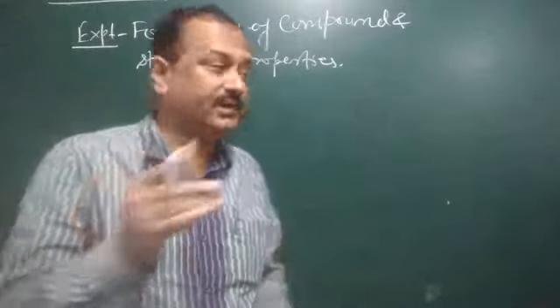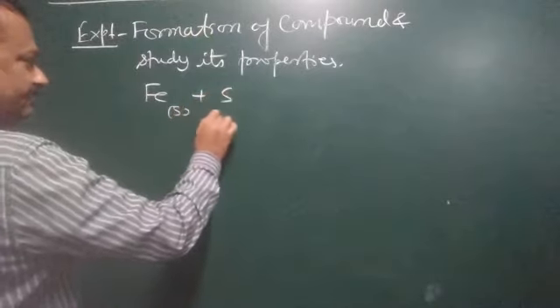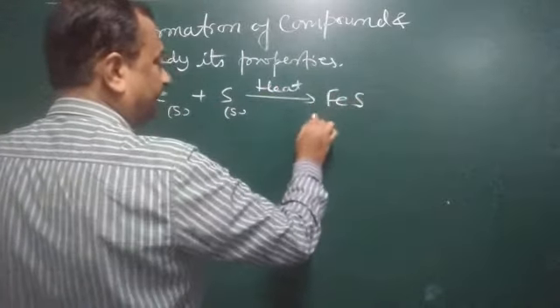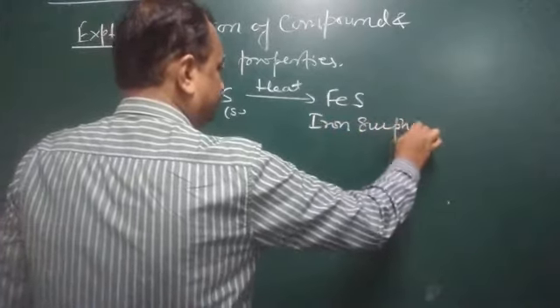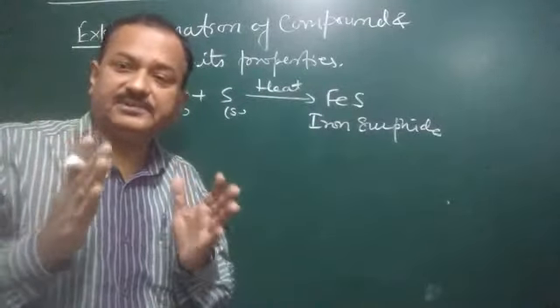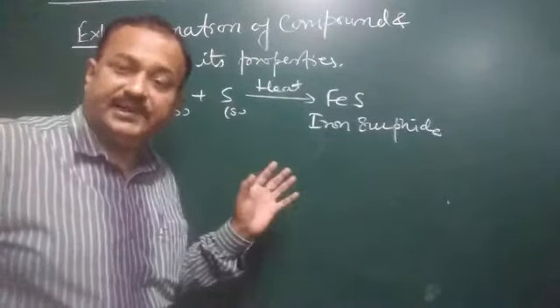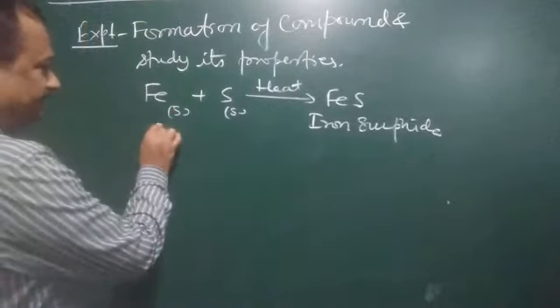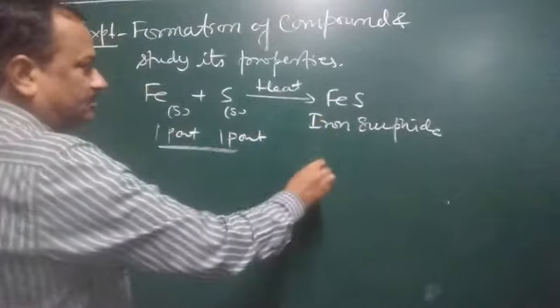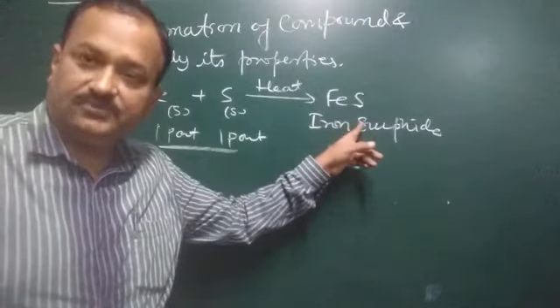Just you have seen — actually here is the reaction: iron solid and sulfur solid, on heating, there is the formation of iron sulfide. I have mixed some amount of sulfur and some amount of iron powder, and on heating, as per the stoichiometry, as per the ratio, it is one part iron and one part sulfur, and there is the formation of this compound in which the ratio of iron to sulfur is 1:1. Both are equal.